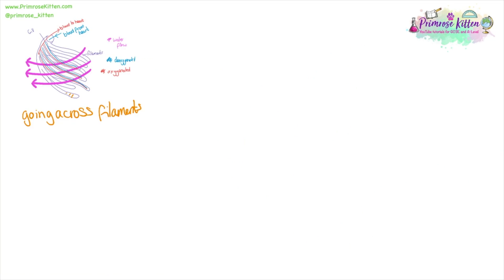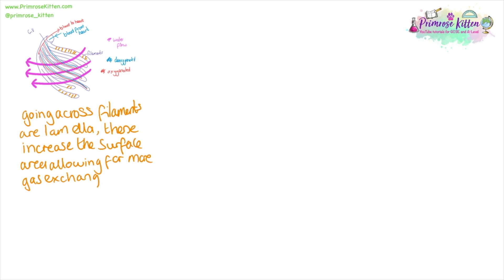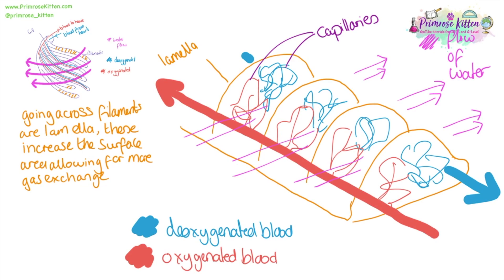Going across each filament are lamella. These are there to increase the surface area, which allows for more gas exchange to take place. Here we have a close-up of the lamella — the filament is this part here and the lamella are the ones going across here.